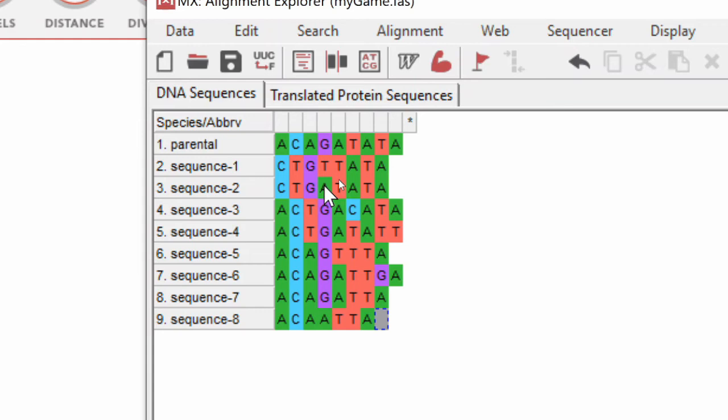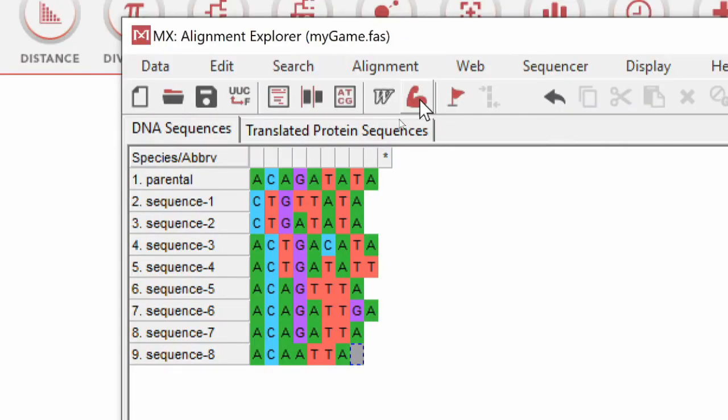And this is one of the central problems in phylogenetics: how to properly align the sequences. The more divergent the sequences, the more difficult it is to align them. So here, we can choose to realign those sequences back.